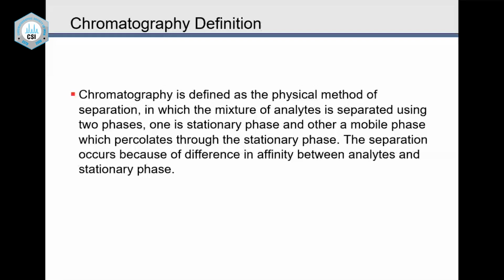Those who have a little less affinity might come the day before or the morning of the day, and maybe spend the whole day with the family and then go. Those who have the least affinity will only come for lunch. Okay, so that is what affinity is. So if the affinity of the compound is more with the stationary phase, it will stay longer. If the affinity is less, it will stay for a very short time, and it will get eluted very fast.